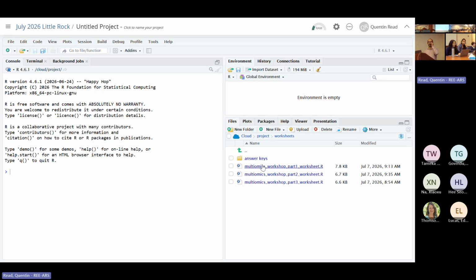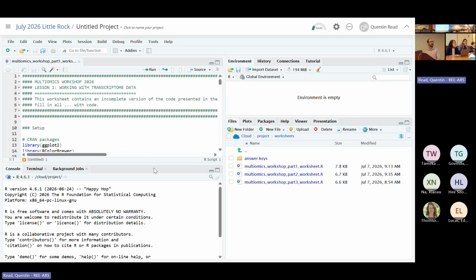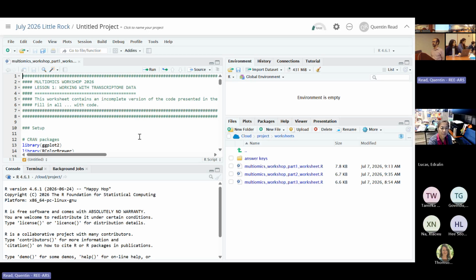Hopefully, Matt, if people get stuck with anything, you can go around and see whether they have a typo in their code and stuff like that. Yes. Okay, so open that up. Can everybody get to this point, either on the demo server or on their own computer? I'll give a minute or two to make sure that everybody is good.